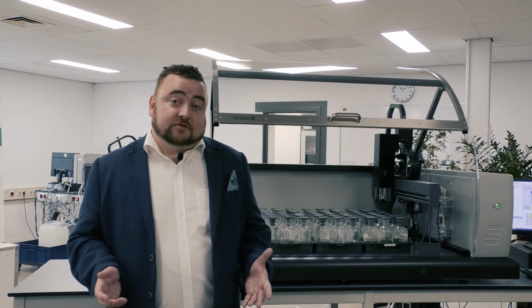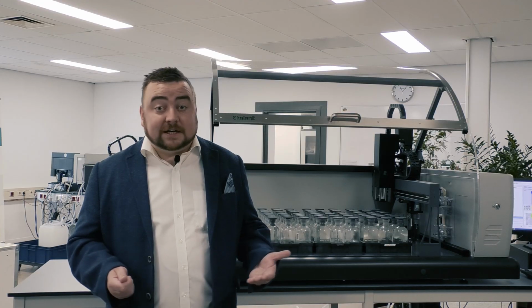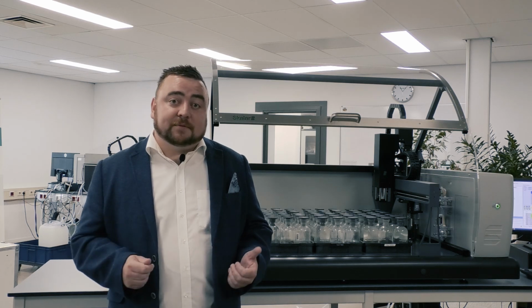What this actually allows is, say, more walk away time, and of course allows laboratories to work outside of working hours, because like I say, you need to get the caps on those bottles as quickly as possible. That becomes especially interesting for your day 5 readings if they fall at weekends, for example, where there's low operator availability or the lab is closed for business those days. The instrument can come back, decap the bottles and perform that final reading.